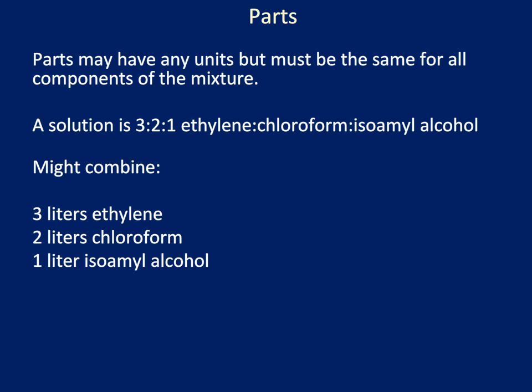For instance, a solution of 3 to 2 to 1 of ethylene, chloroform, and isoamyl alcohol might combine 3 liters of ethylene, 2 liters of chloroform, and 1 liter of isoamyl alcohol, although these volumes are rather unrealistic.